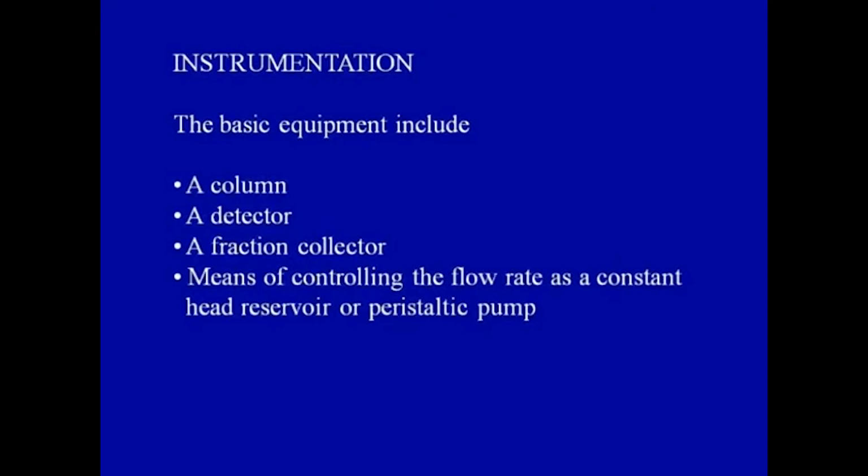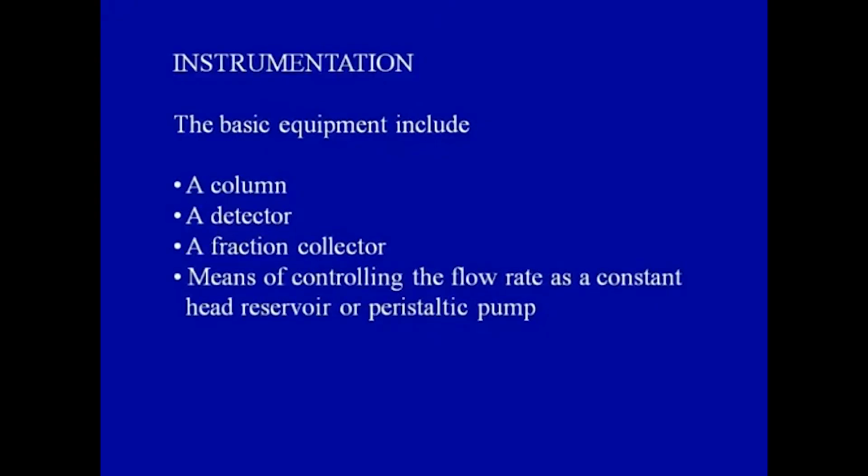Now, if you consider the instrumentation of gel filtration, it is very basic, as we have already discussed earlier for low pressure chromatography and for high performance liquid chromatography. In instrumentation, the basic part is you require a column, which is, like I said, a long and narrow bore column.